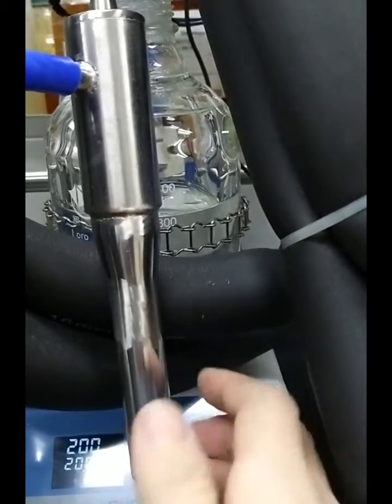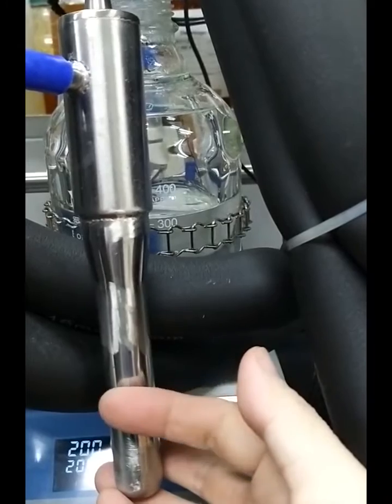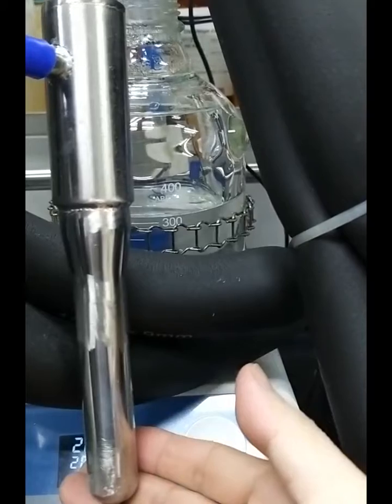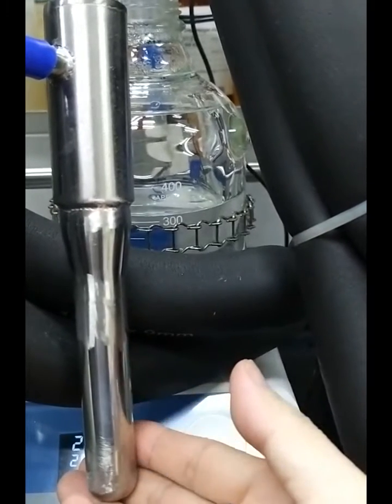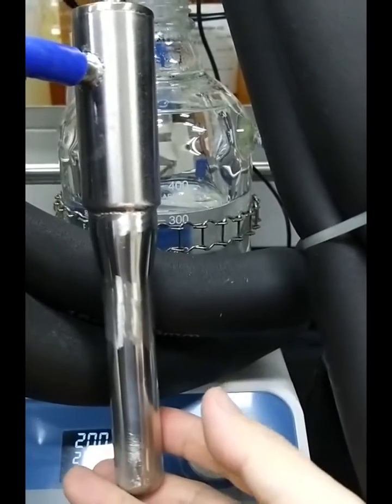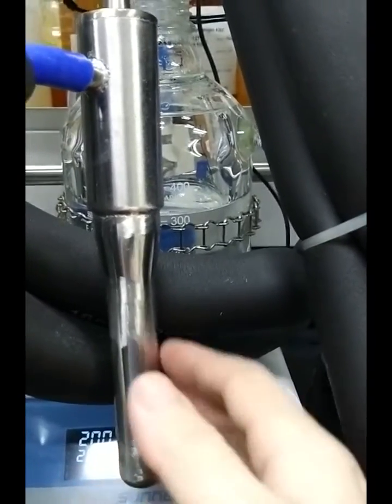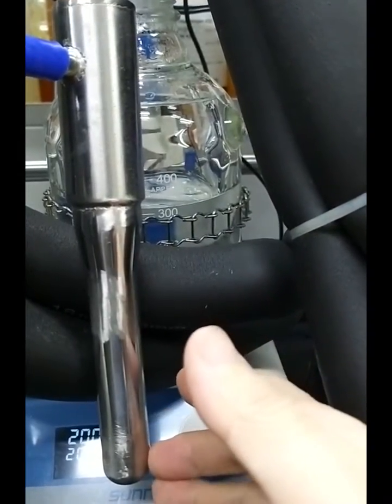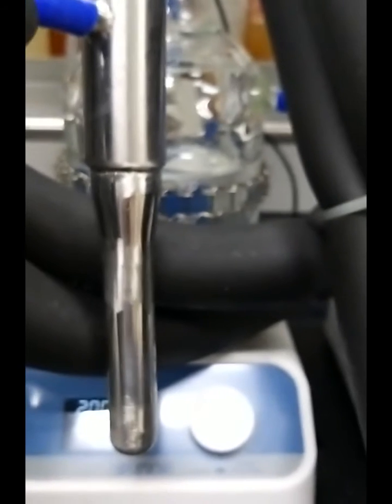This allows the wax to be deposited on the surface of the cold finger. The diameter of the cold finger can be manufactured based on your inquiry. The depth of the cold finger inside the product can also be adjusted based on the positioning of the cold finger inside the reactor.